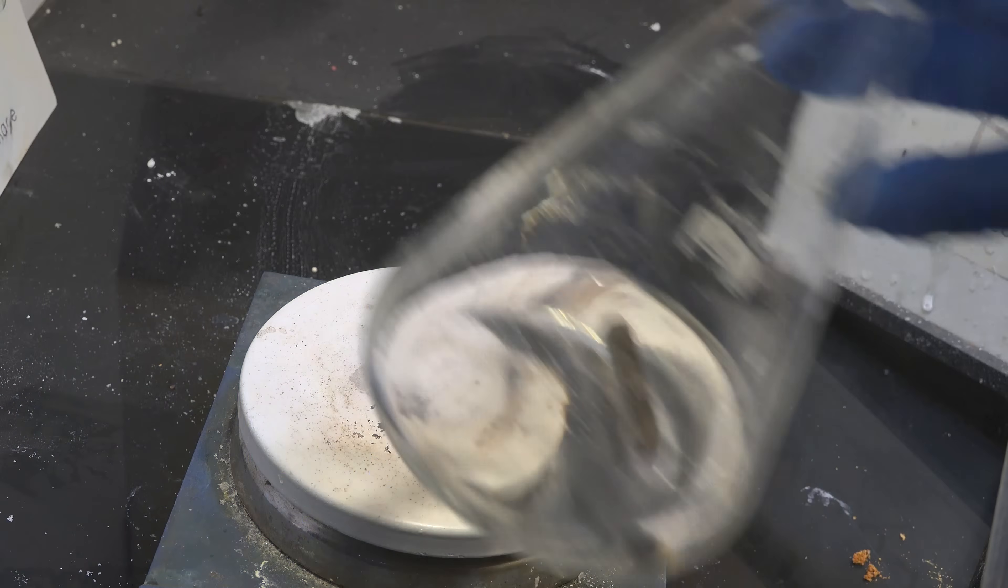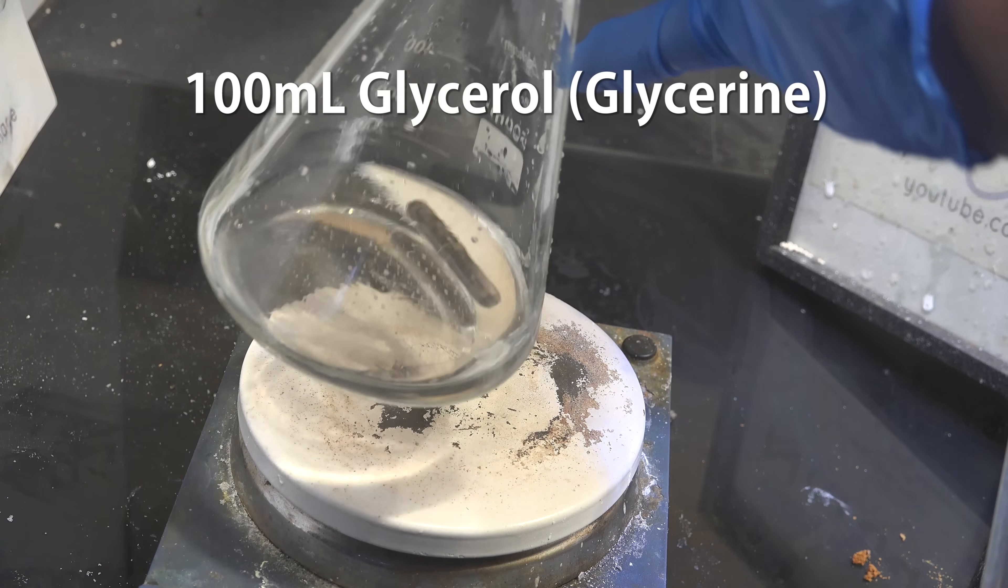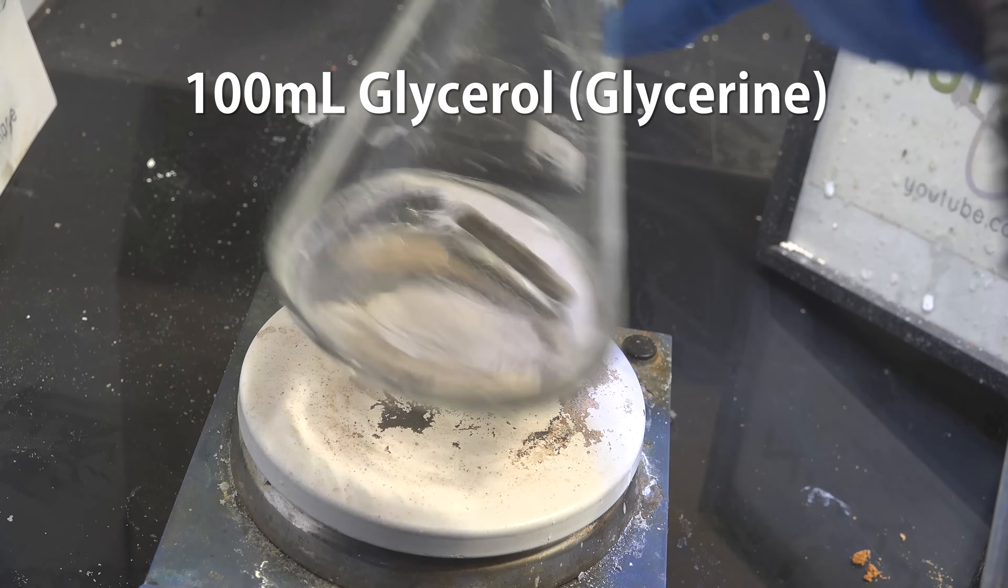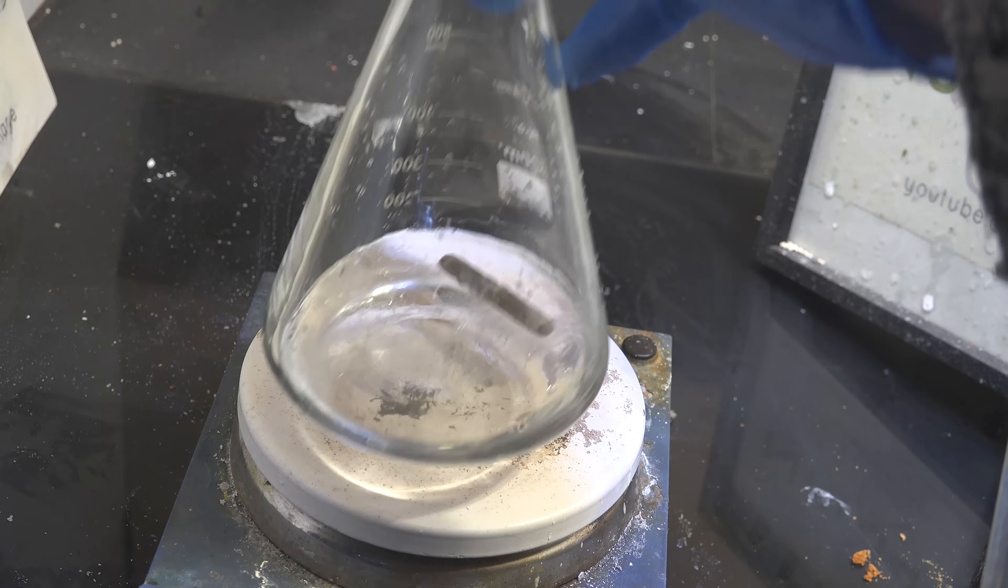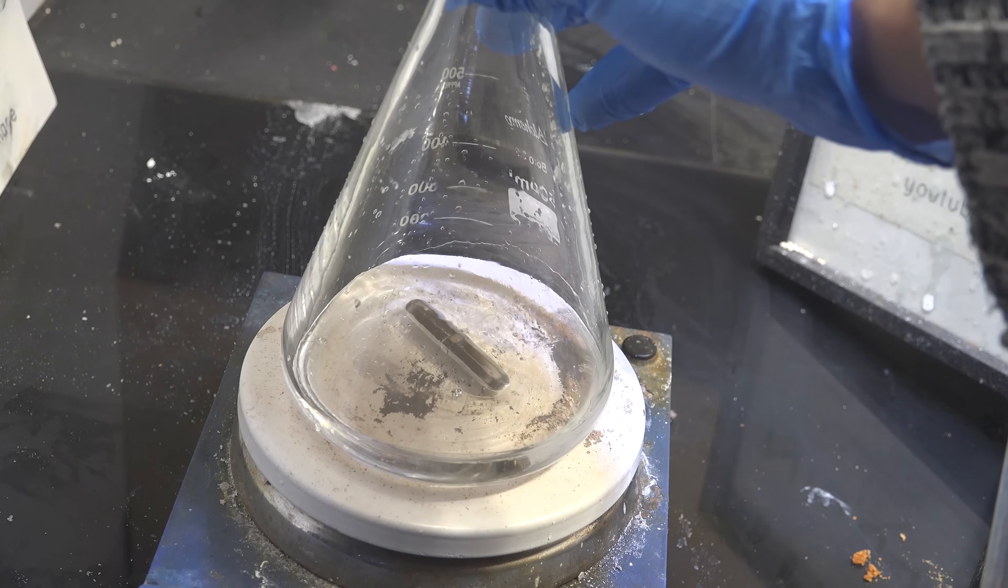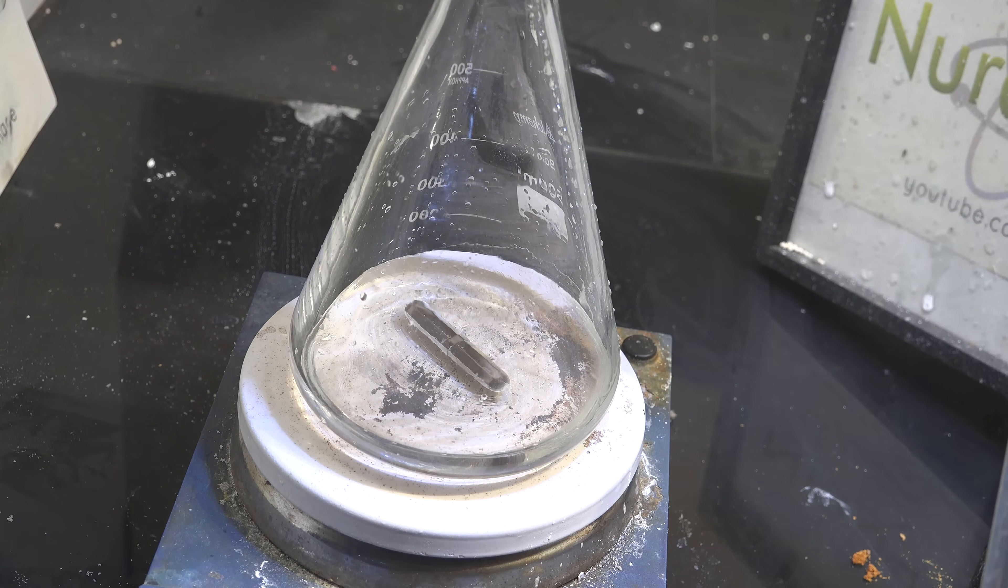So let's get started. Get an Erlenmeyer flask with 100 mL of glycerol, also known as glycerin. This can be found at pharmacies or from soap making companies. I recommend soap companies as it's cheaper.